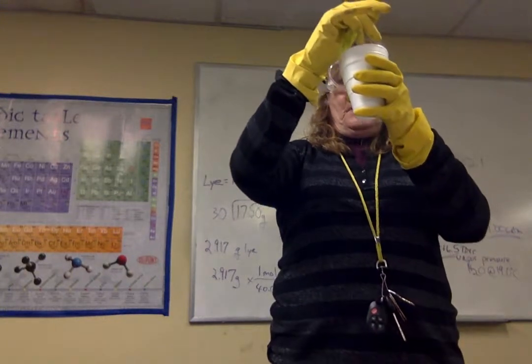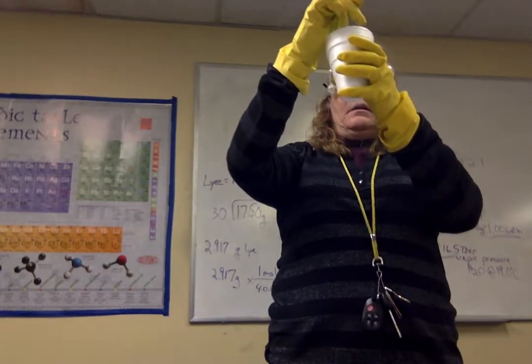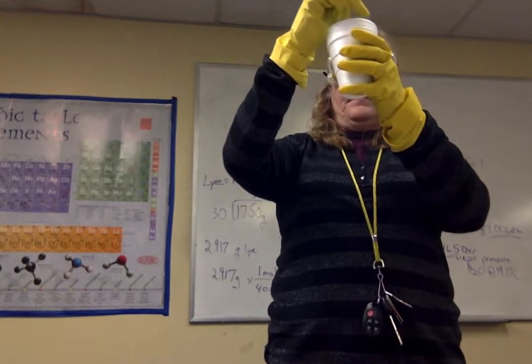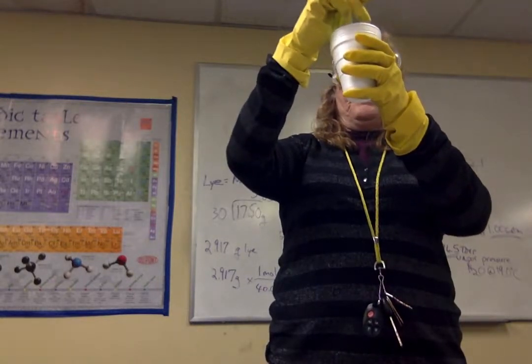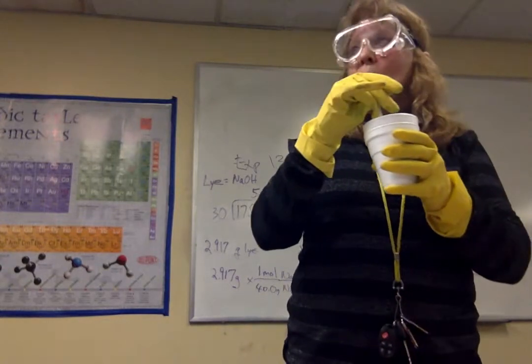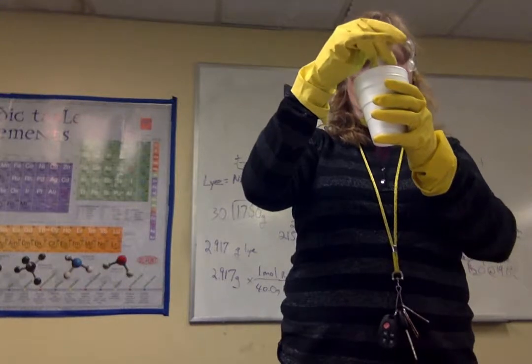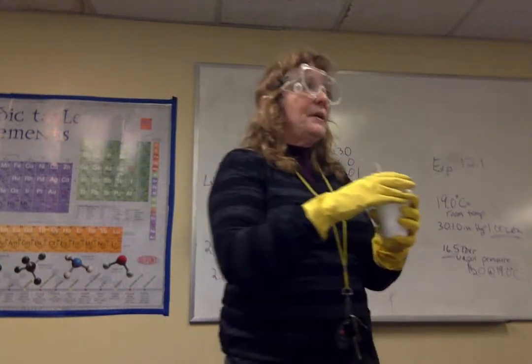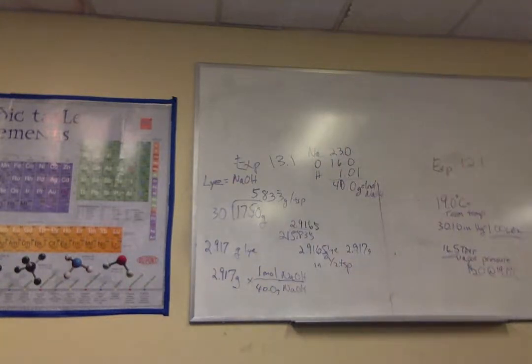It went up to 30.3 or 4. Is that the T final? T final, yep, 30.3. Now it's going to go down again, so you take the highest one, I think. Yeah, 30.3. All right, so now you have your delta T. Calculate everything you need for Q equals MC delta T, right?